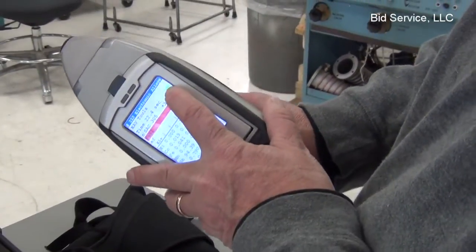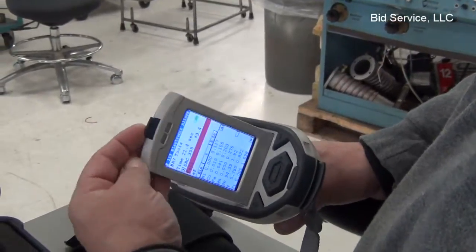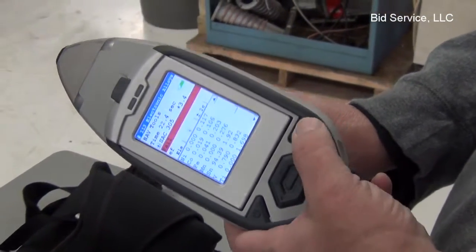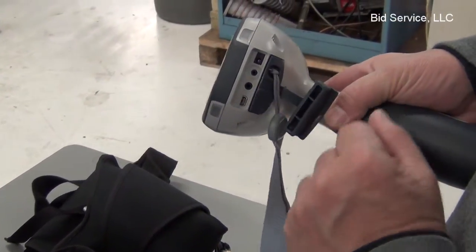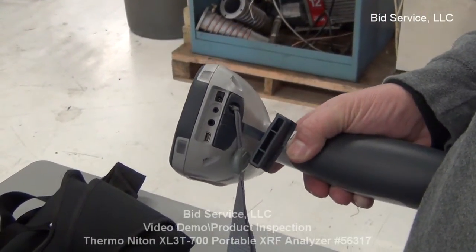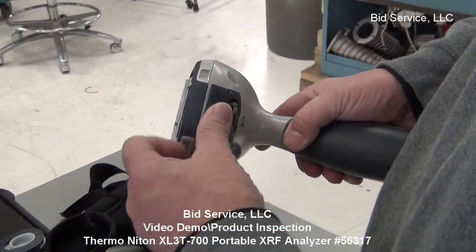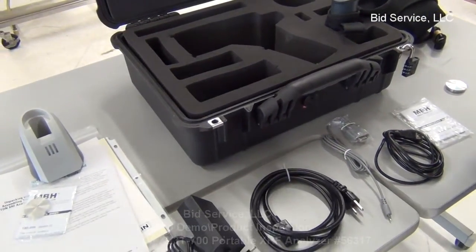The instrument has a battery display, and everything is working. The display is maneuverable, so you can hold it in different positions and monitor the display. You have touch keys to go through menus, a return key, and on the bottom are your data ports so you can connect to a computer. It does have a USB cord, and it also includes software to take your data from the device and transfer it to a computer. Very simple.